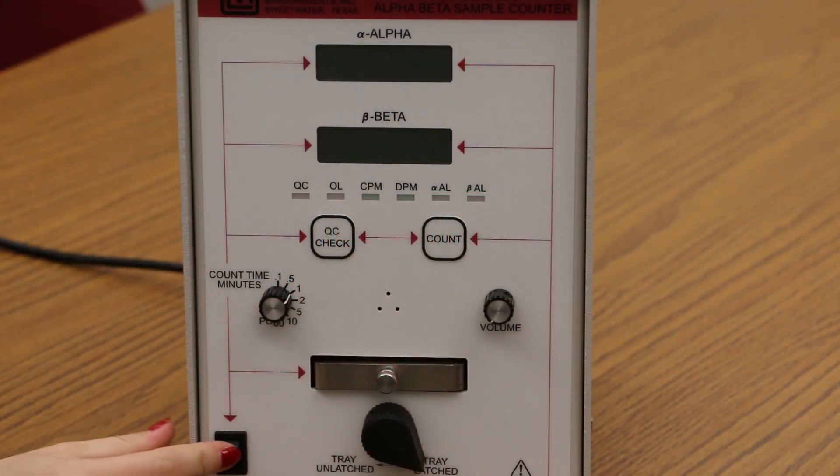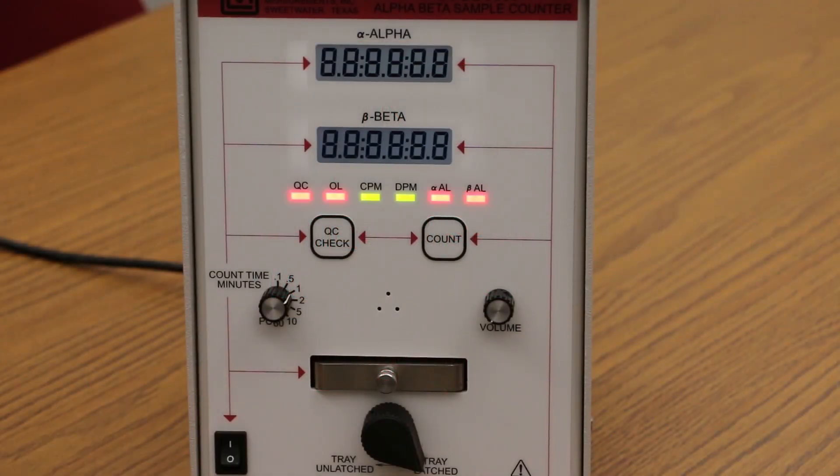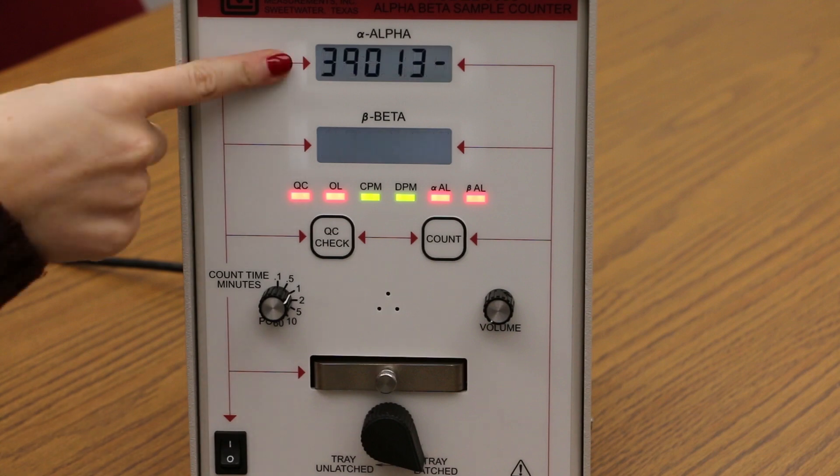Basic use. Turn the power switch on. The readout LEDs will illuminate and the instrument will display all eights and colons as a test of the segment. Then it will display the five digit firmware number. Next it will display the version number. The instrument is now ready for use.